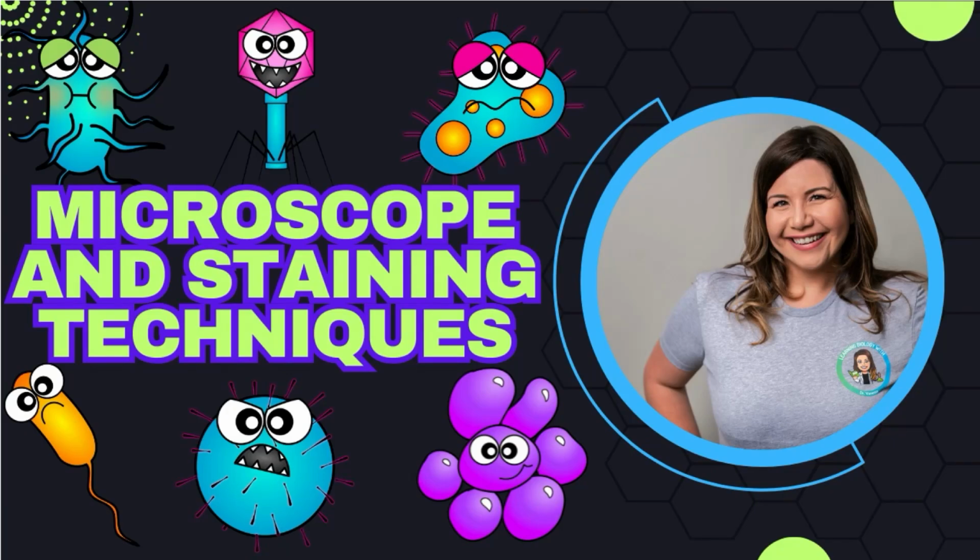Have you ever stopped to think about just how small microbes really are? If you lined up 1,000 bacteria end to end, you'd still barely cover the width of a grain of sand. Viruses? They're so tiny you could fit millions inside a single bacterial cell. To study this small world, we need tools that bend light, sharpen detail, and reveal structures invisible to the naked eye. That's where the microscope becomes one of the most important instruments in all of biology and healthcare.